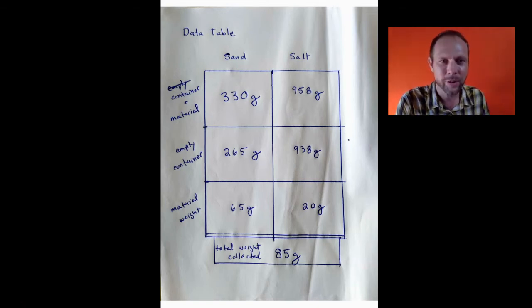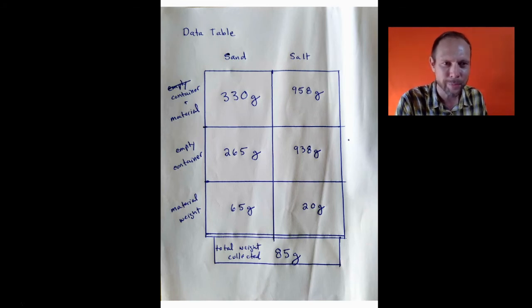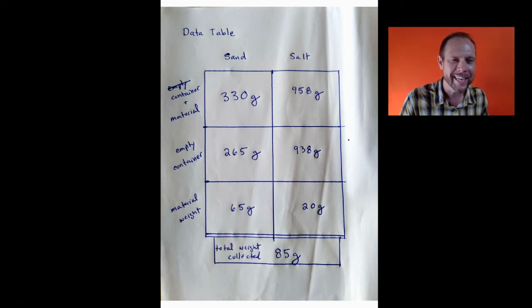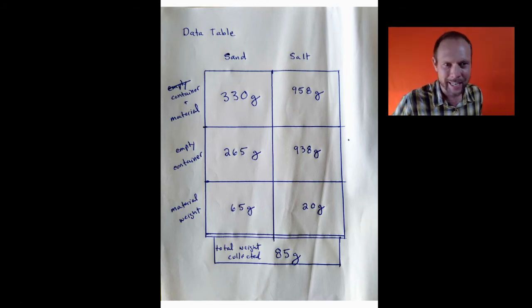And if you're interested at some point in making a lab report out of this experiment, you've got the data. These questions that I just posed would be the type of material that we would discuss in a lab report, and again, perhaps coming up with some ideas what you might do a little bit differently to make the experiment work out better.